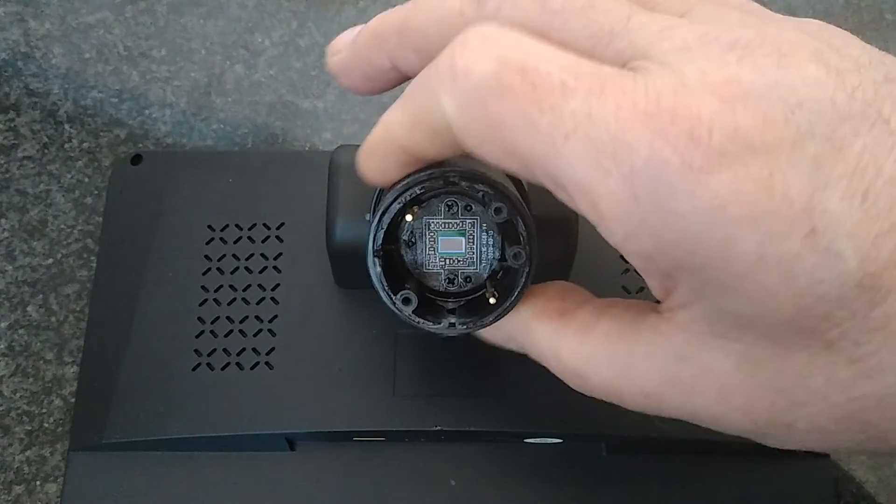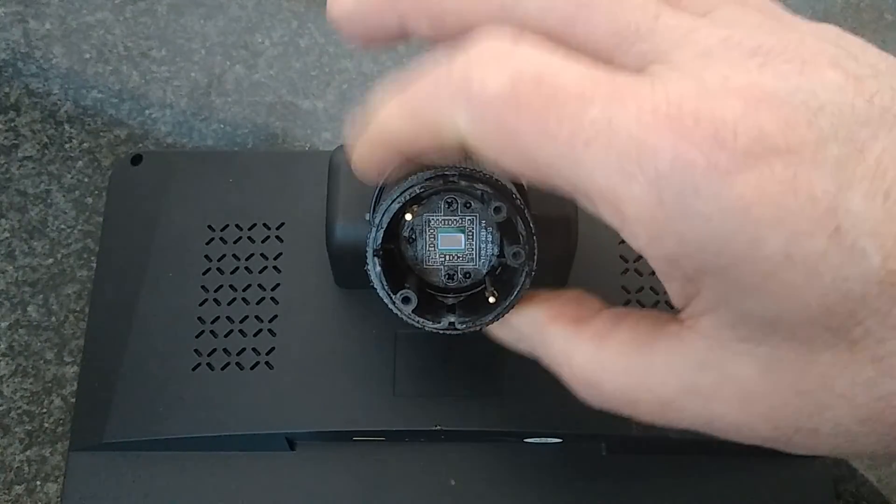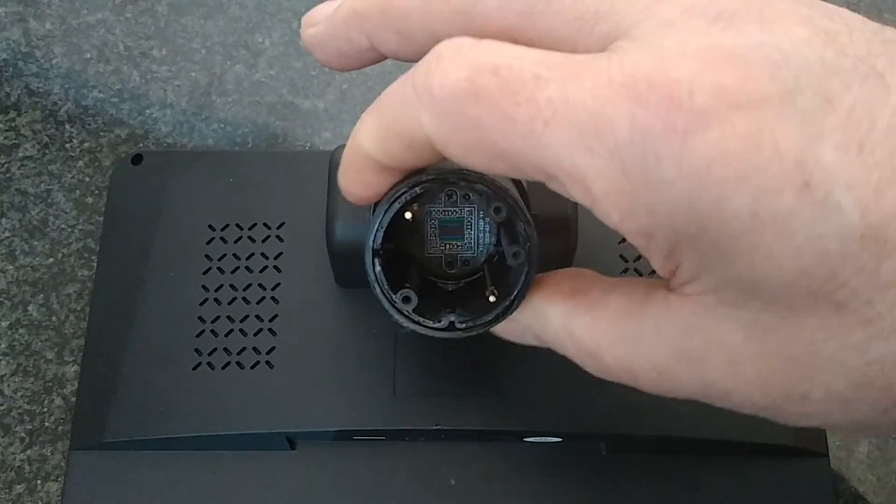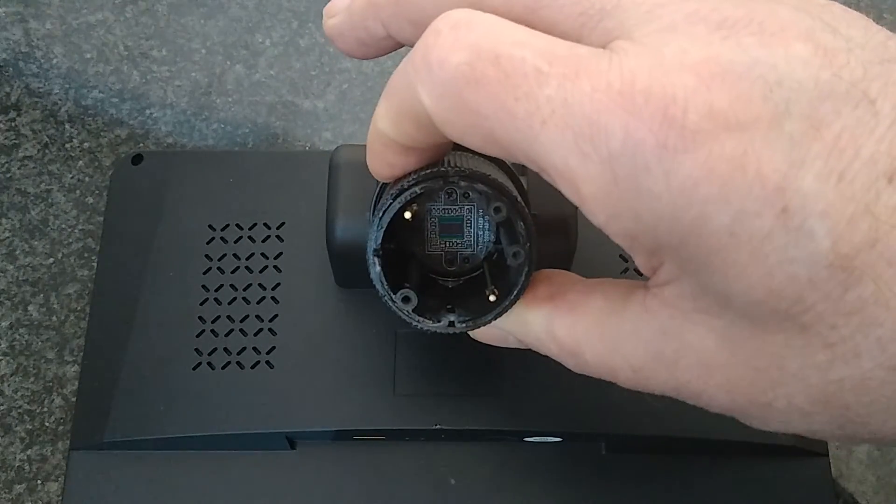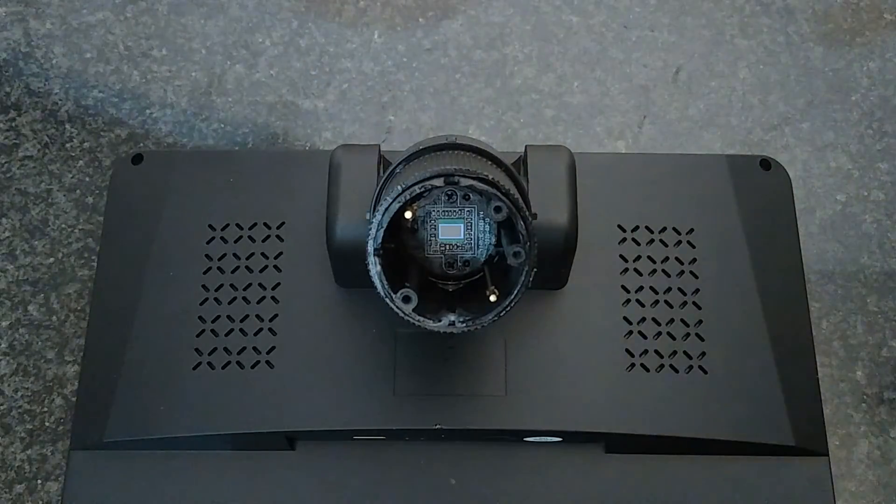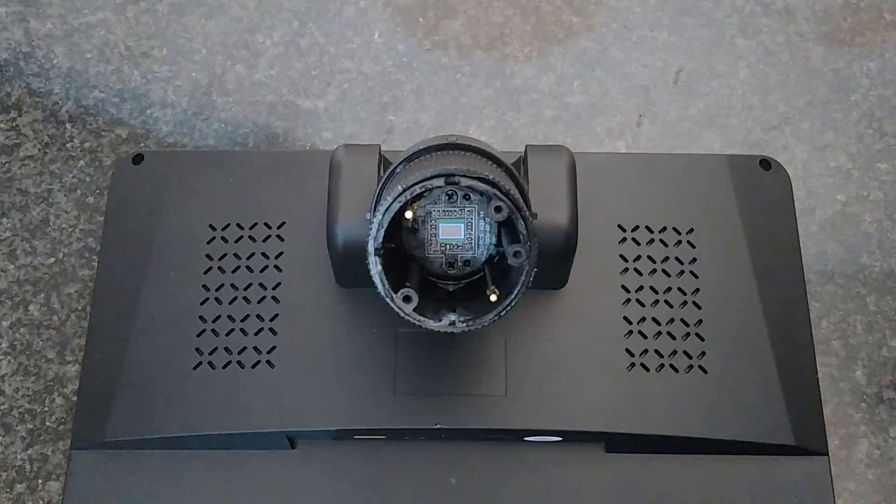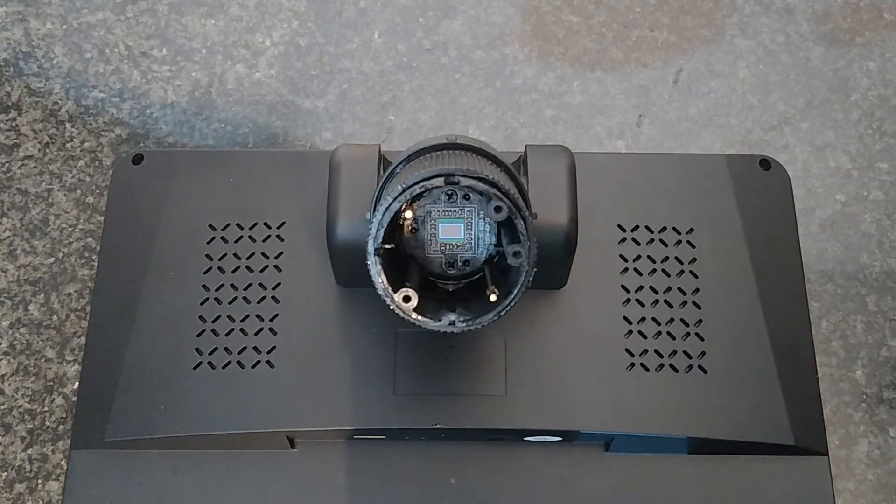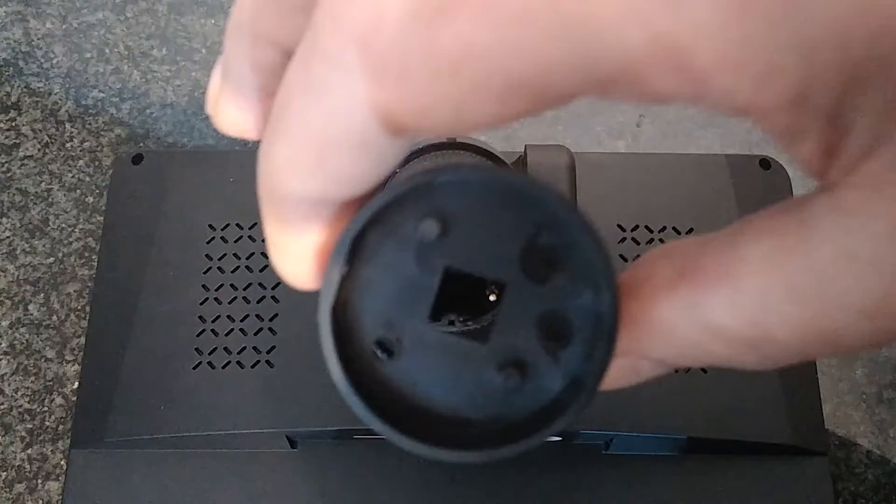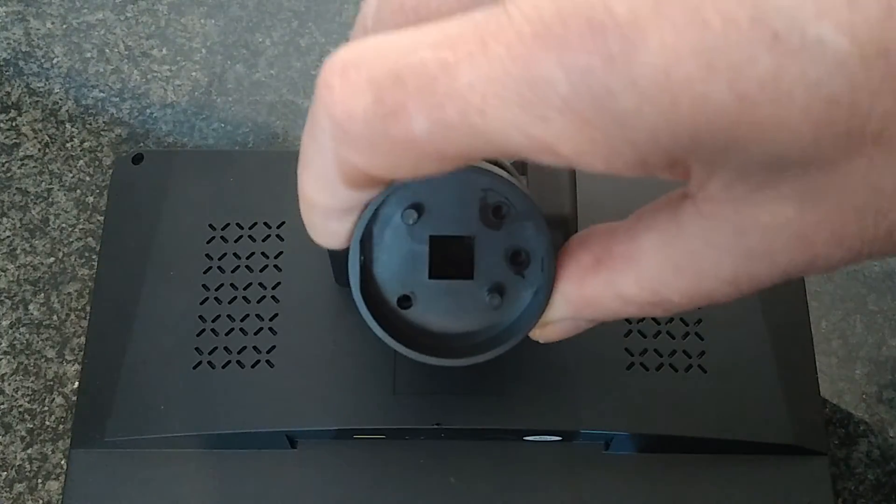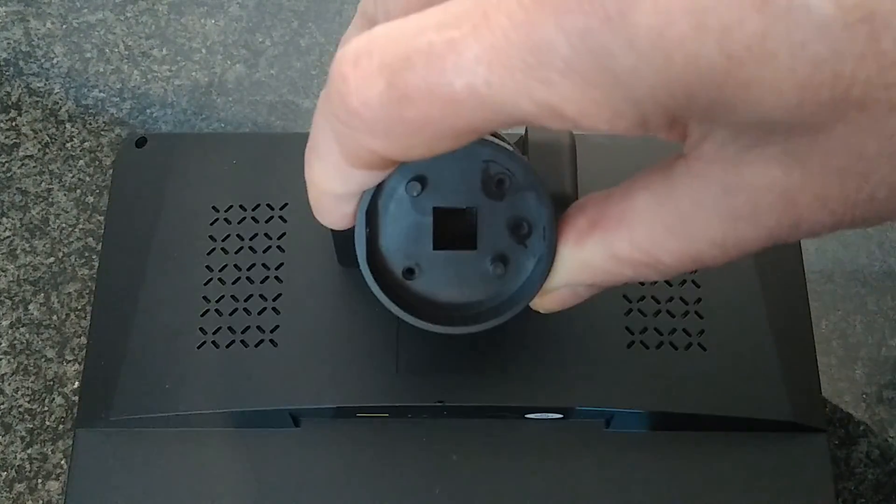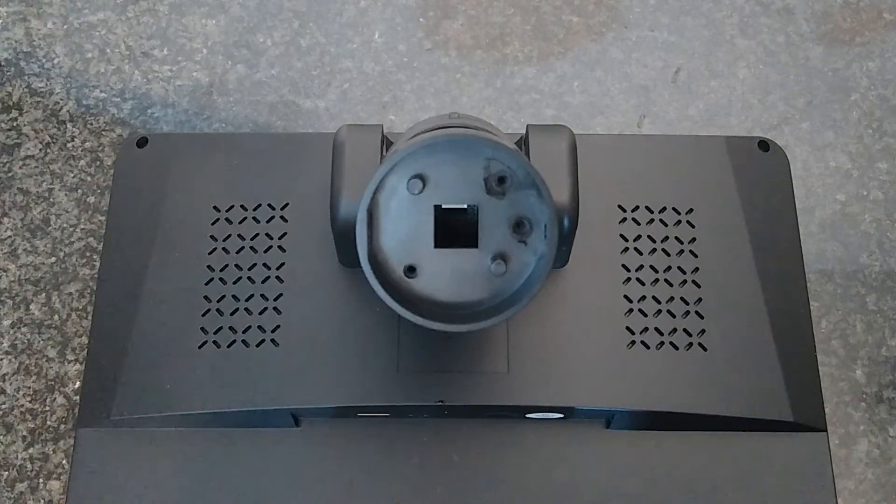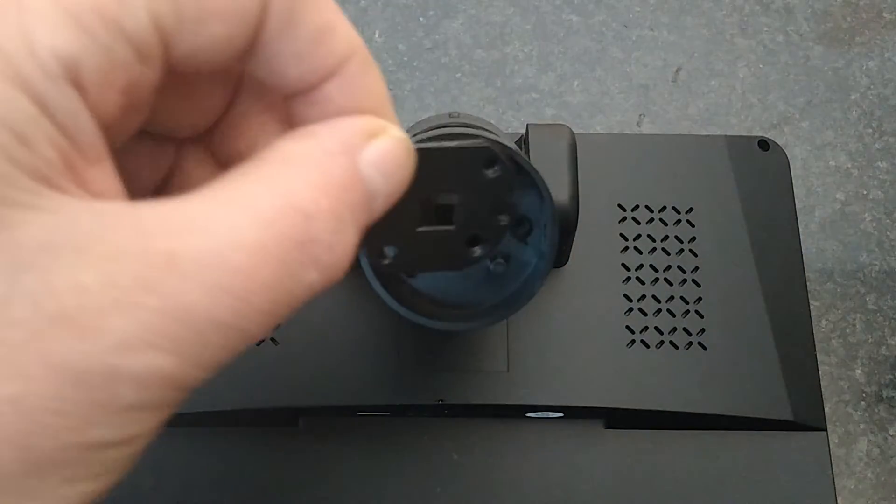Here I am looking at the zoom lens. No lenses are moved, but the CCD chip itself moves up and down, supported by an excess of helicoid grease to clog the play. And there appears to be a piece of glass glued into the plastic cover that I think serves as a UV filter.